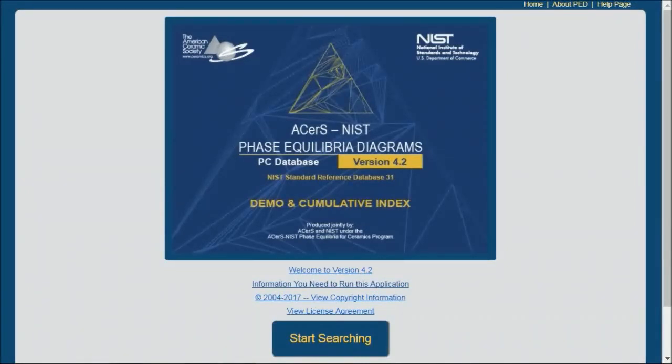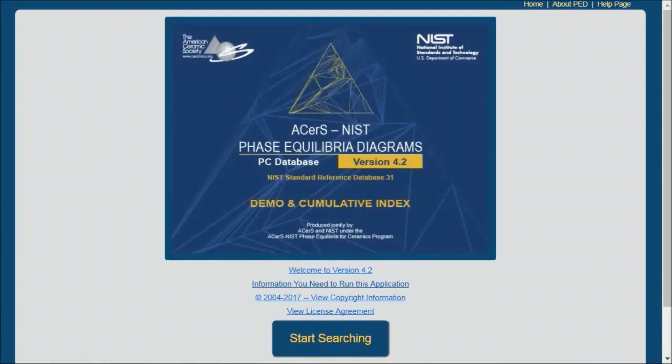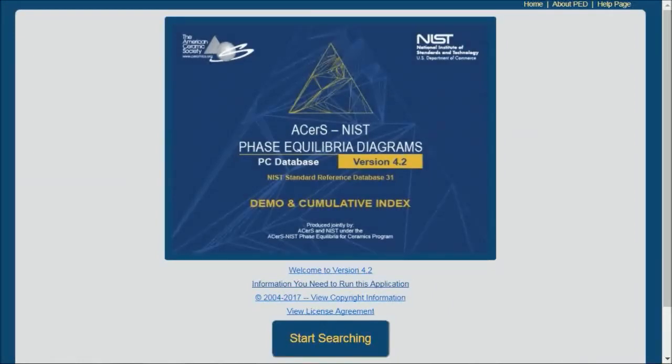In part two I'll demonstrate some of the advanced features including the Phase Equilibrium Diagram Viewer, which is software that makes extracting composition and other information quick and easy.